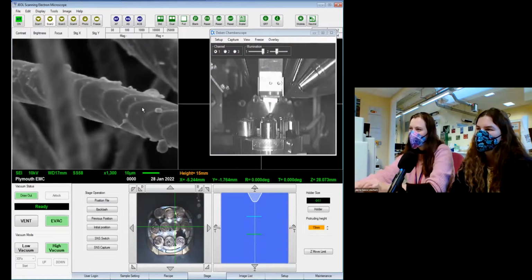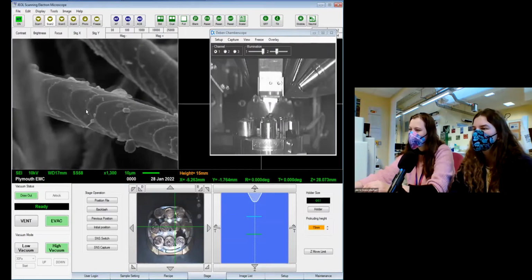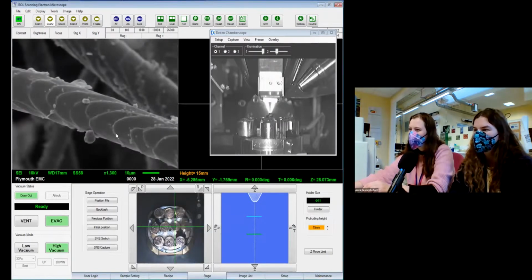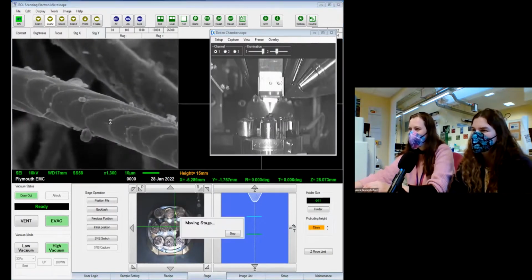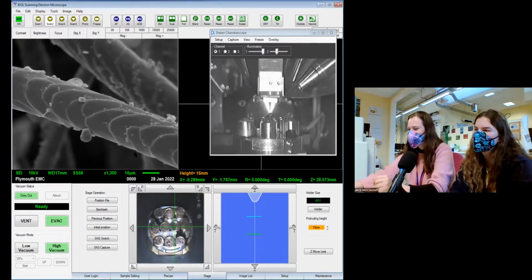Trying to get the right bit in focus. Get like tulip leek vibes. Yeah. Maybe spring onion. Okay, so setters are leeks, cats are tulips, border collies are spring onions. Perfect. Got it.